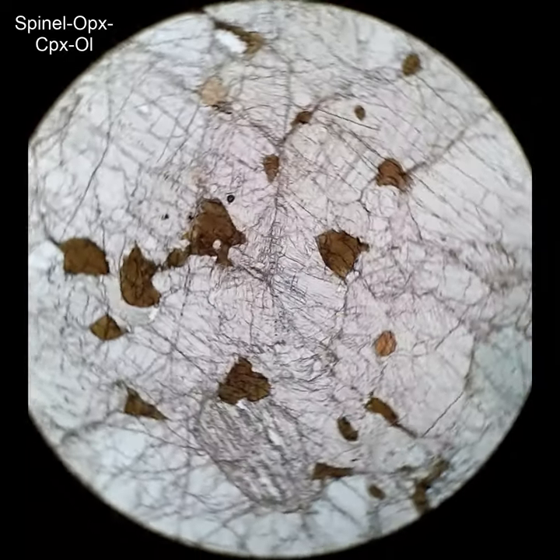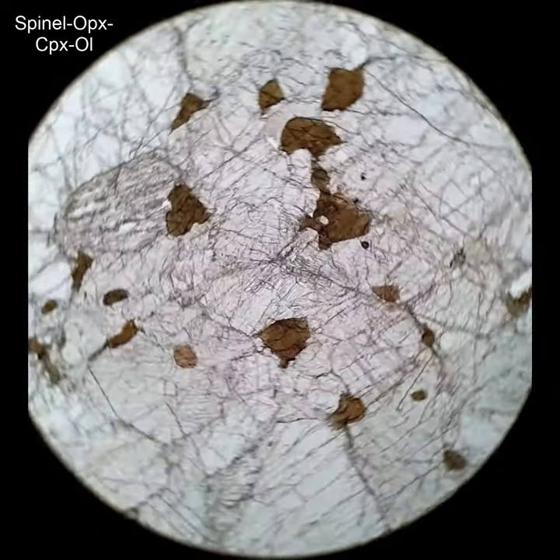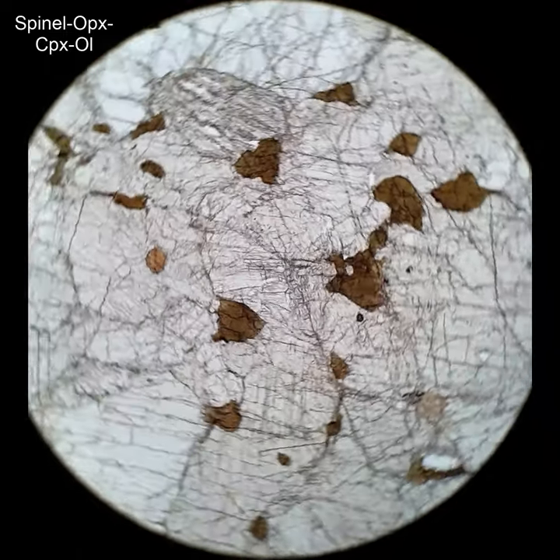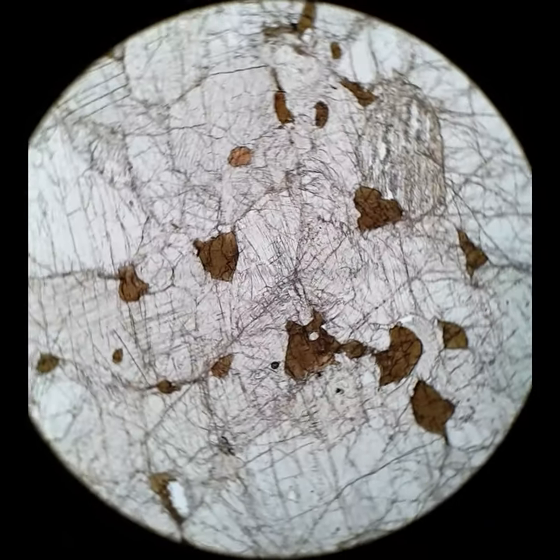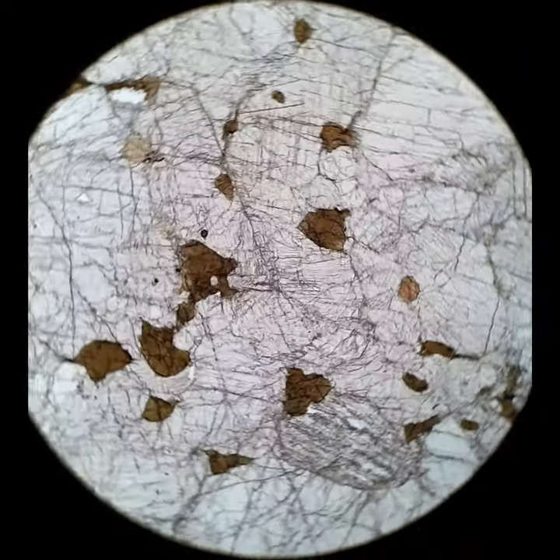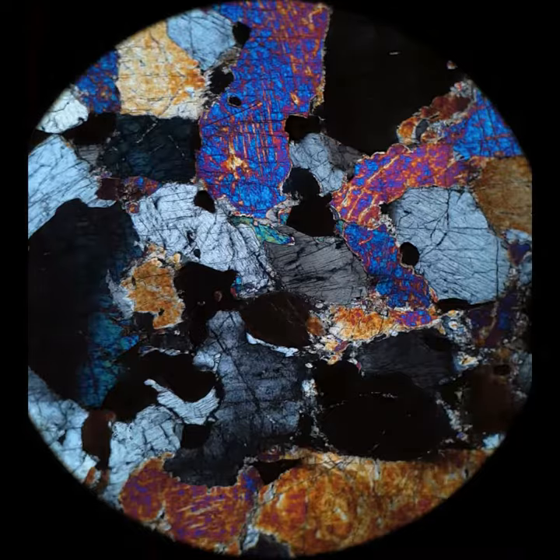Now this is a spinel peridotite, so those brown grains are spinel. You will be able to see that when I cross the polars. All of the other minerals in there are birefringent, but those brown grains are now black and they stay black.